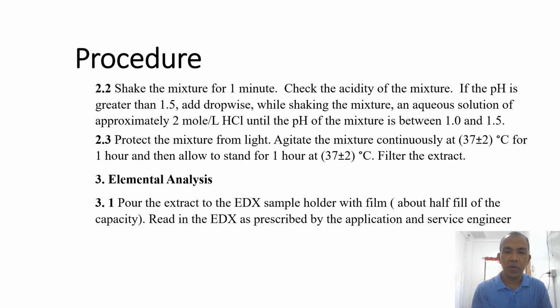So protect the mixture from light, agitate the mixture continuously at 37 degrees Celsius in a shaking water bath. And then filter the extract after agitating in the water bath. So for the elemental analysis of the extract, we fill the sample holder that I showed in the previous slide, half fill only, and then read the EDX as prescribed by the applications engineer or service engineer.